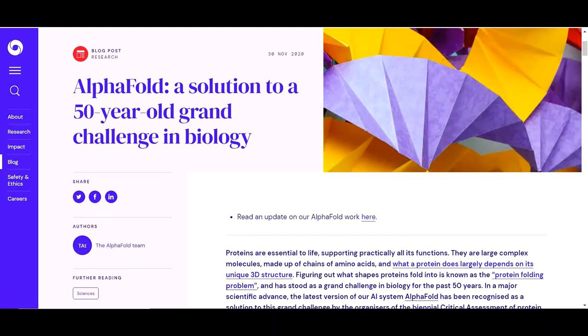Hi, we are very excited to share with you AlphaFold 2. This is AI-based software to make predictions about the 3D structure of proteins. In this video, we will show you how easily you can obtain your protein's 3D structure using AlphaFold 2. So let's begin.